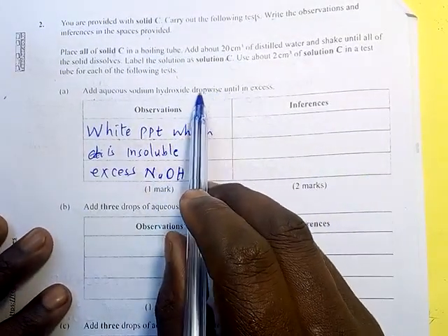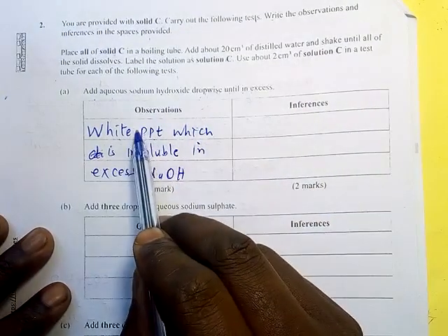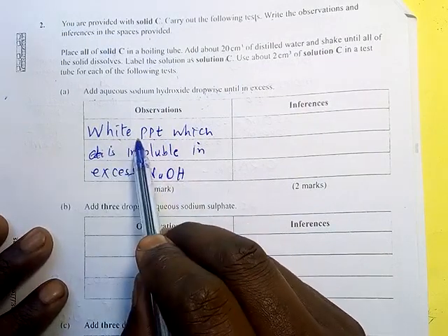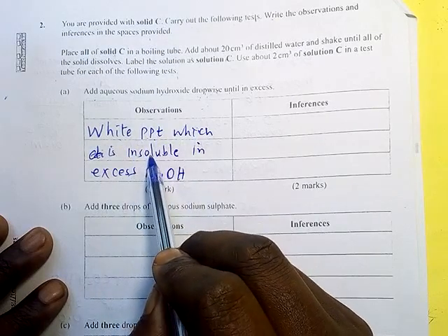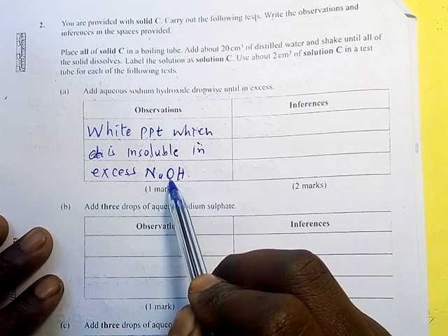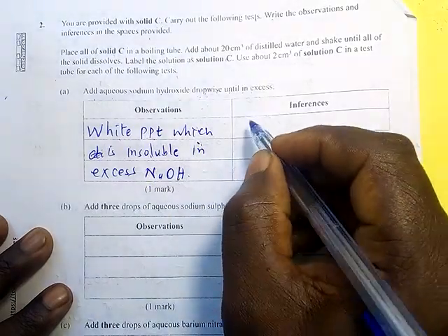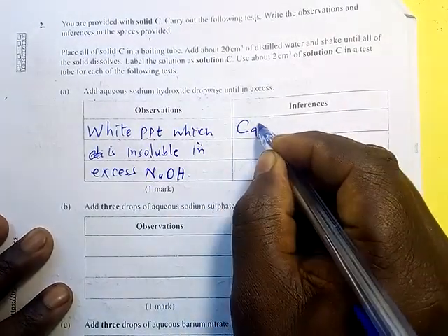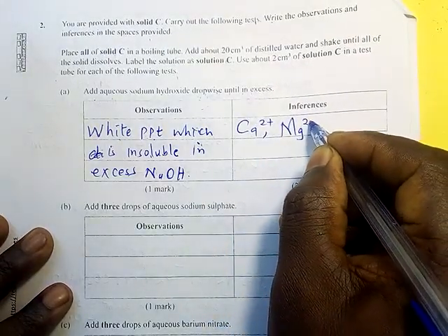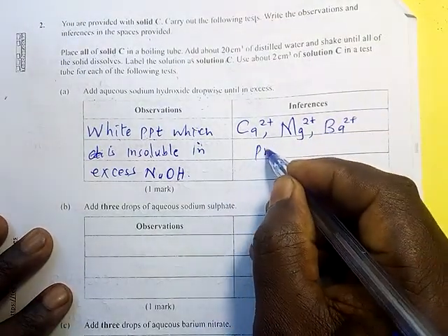Whenever you are asked to add sodium hydroxide dropwise and then in excess, you should first use the 2 drops, make the observation, and then add in excess, make the observation. So a white PPT is formed which is insoluble, which does not dissolve in sodium hydroxide, meaning the white precipitate remains, persists. So if that is the case, then what is present? What is present is calcium 2 ions, magnesium 2 ions, and barium 2 positive.